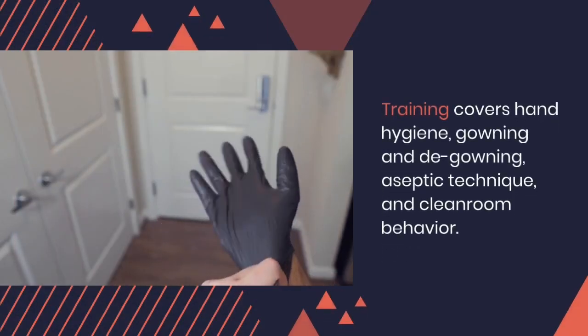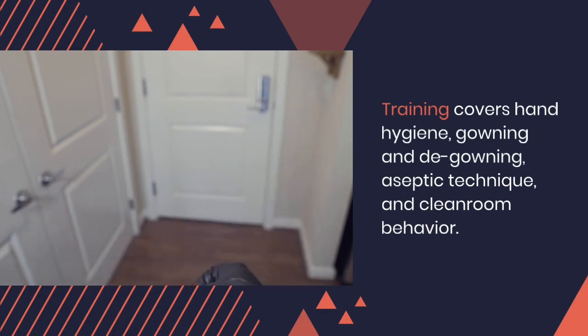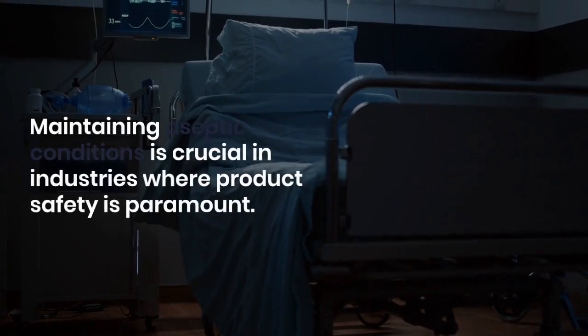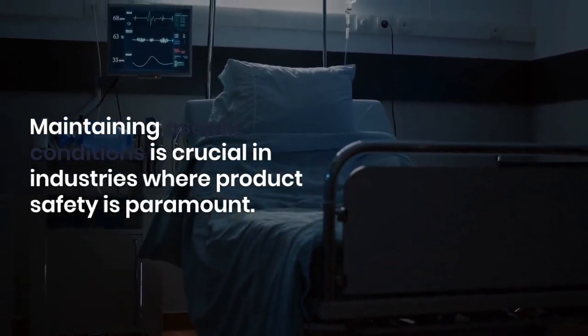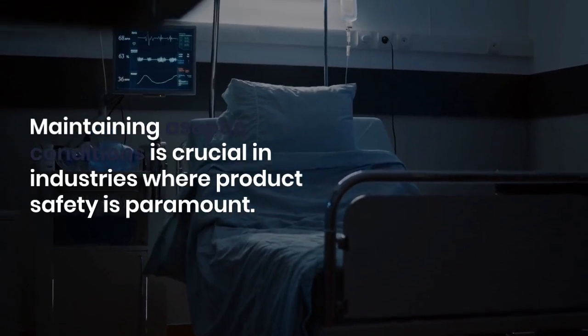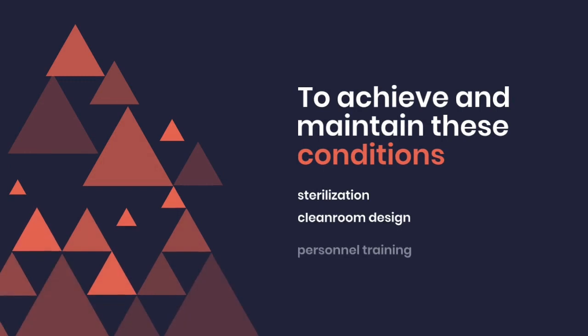4. Personal protective equipment (PPE). Sterile areas require personnel to wear appropriate PPE to minimize the introduction of contaminants. This typically includes sterile gowns, gloves, head covers, face masks, and shoe covers. The PPE should be donned and doffed following specific protocols to prevent contamination.